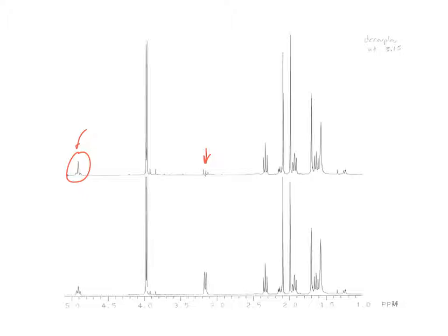However, when you do that, you usually hit a bigger window. The decoupling range will get bigger and bigger, which doesn't really matter in this case because there are no other signals nearby. But if you're trying to irradiate a signal and you have other protons close by, then it starts to become more sloppy. You start hitting more than you want. So this clearly shows again that those couple with each other.